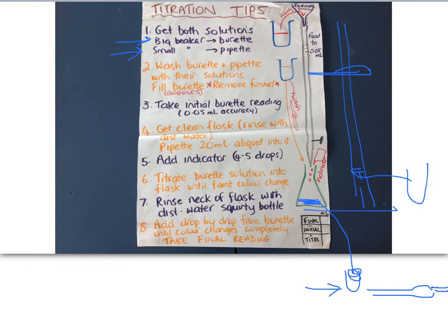It doesn't want to have any water in it, it wants to have that solution in it. If there's any water in it, it's going to dilute it. The burette needs to be washed with the solution that's going into it as well. So you just need to pour a little bit in and get the burette and roll it. Put it on its side by the sink and just twist it in your hands around and around so that you're thoroughly coating all the walls of it and then drain it down the sink. Do that with the pipette and the burette.